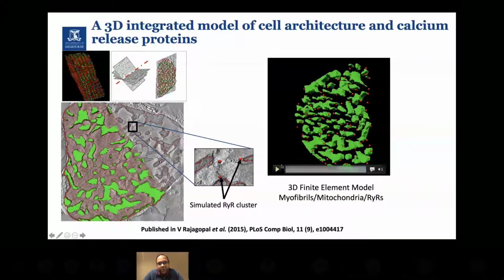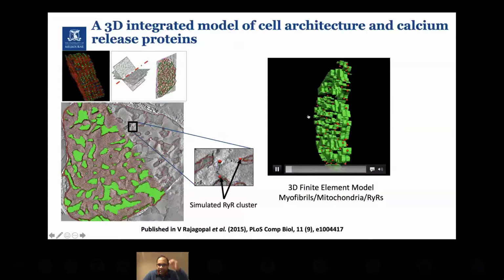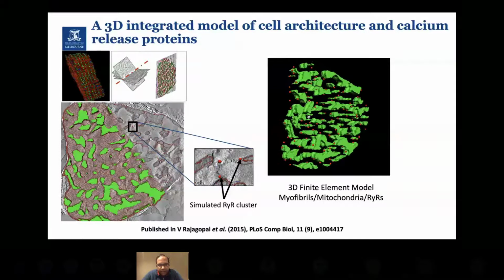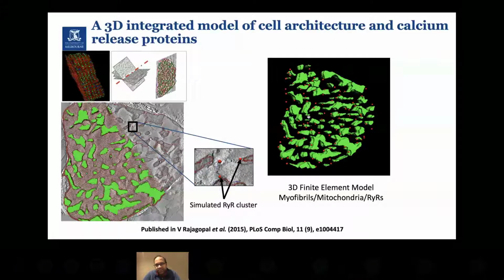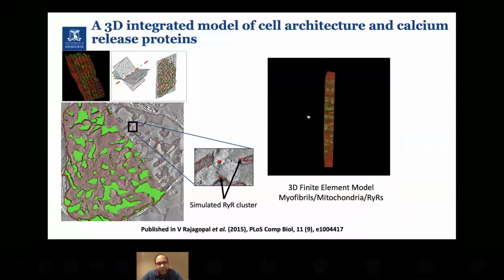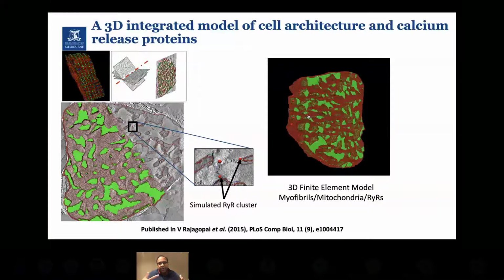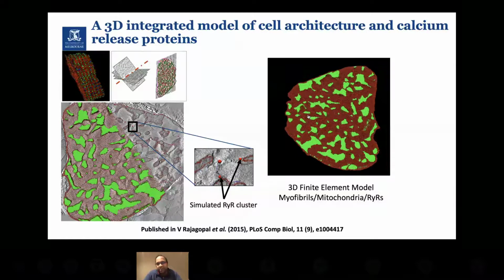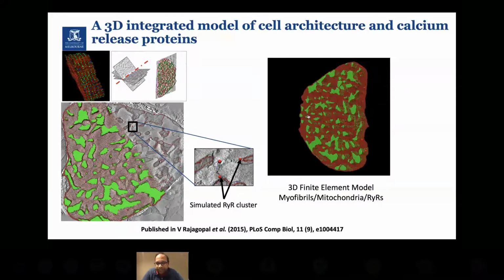What we can do now is we can take these models and we can simulate not only energetics, but we also simulate calcium dynamics and mechanics as well, so that we can really go to town with, not just looking at images, but also gaining biophysical insight from those images, using our techniques.